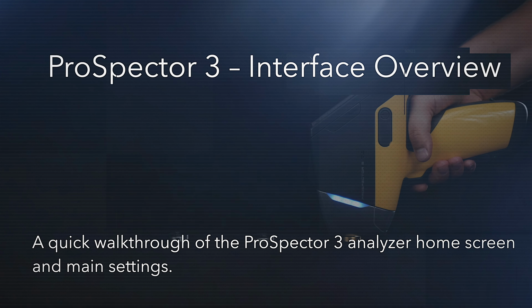And if we turn it off, now you see that there is no button on the screen, and it's not suitable to work in the lab stand. And if you work in a lab stand, you definitely need to use this start stop button, because it's not convenient to press the trigger.